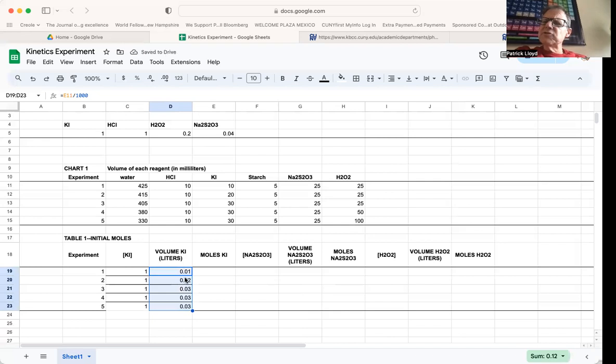It's always a good idea when you have a spreadsheet program do that sort of filling, just to make sure that it did the right thing, because sometimes you get the wrong cells. These are all cells, right? So 30 should give me 0.03, right? 30 divided by 1,000 is 0.03. So it looks like it did all those right.